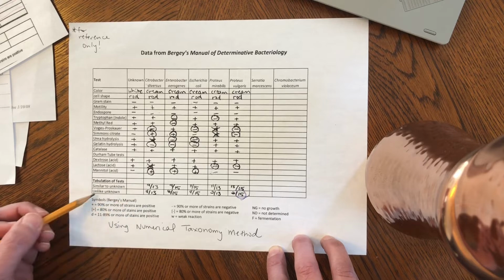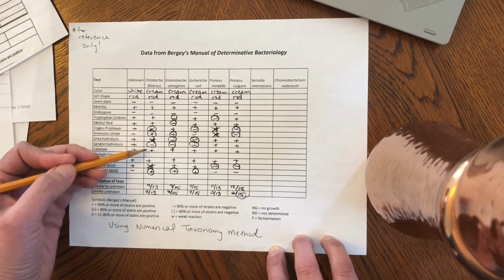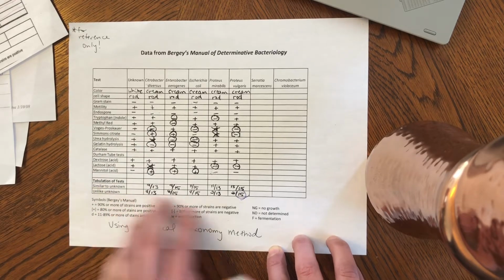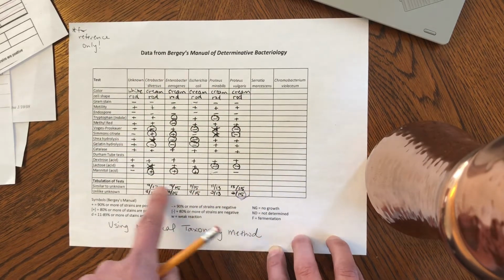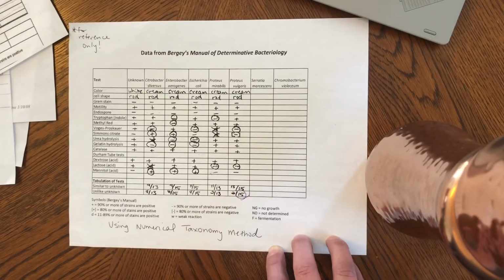So on the flip side, unlike unknown is 4 out of 13. We're going to count the ones that are circled. 1, 2, 3, 4. So that's how we get 4 out of 13. So the idea is when you're done with all of this, the bacteria that has the best test results out of this similar to unknown are likely to be your bacteria.